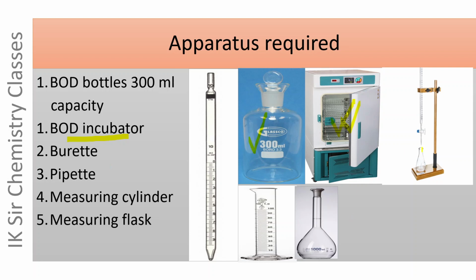Burette, stand, conical flask, pipette, measuring cylinder, and measuring flask. These apparatus are required during the experimental determination of BOD.